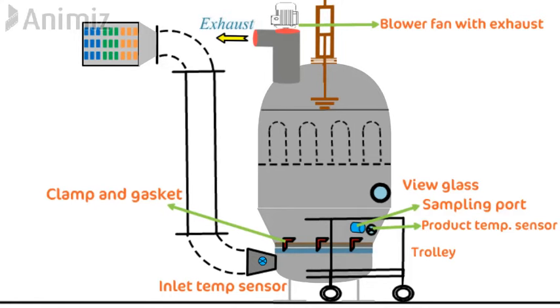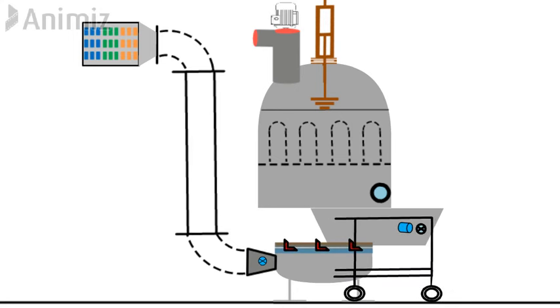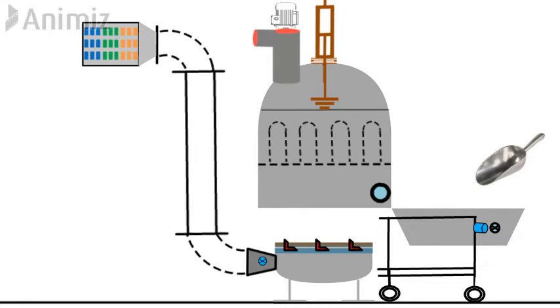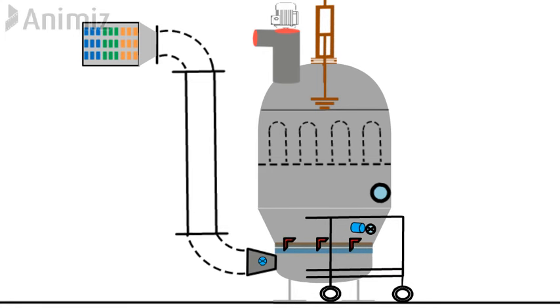Now let's see how a fluidized bed dryer works. First, we open the clamps and take out the product container by moving the trolley out. We charge the container with the product to be dried. The product container has a perforated bottom with a high mesh number sieve so that it only allows air to pass through and not the particles. After loading, it is moved back to its place with the clamps locked. After locking, the exhaust fan starts creating a partial negative pressure which draws air inside the chamber. This air is filtered and heated to a specified temperature and reaches the bottom wind inlet chamber.